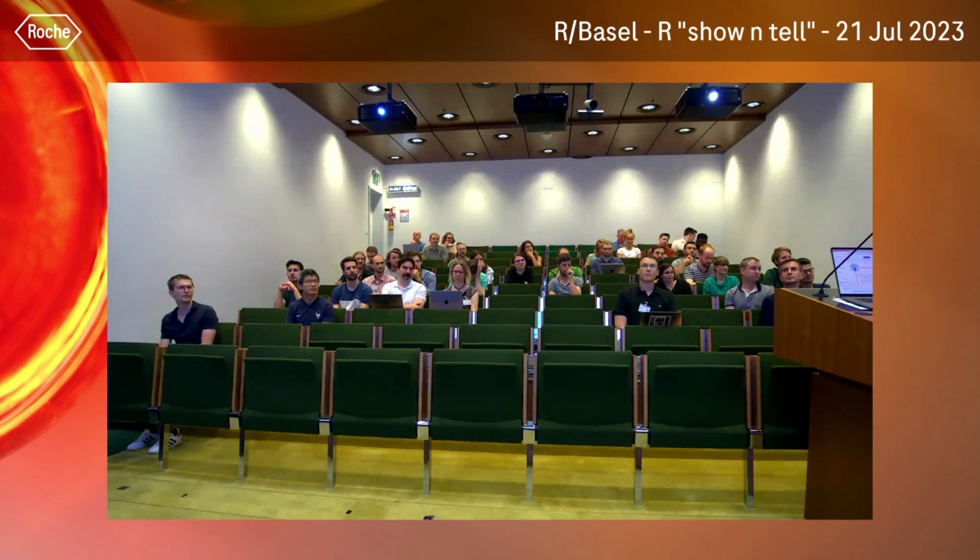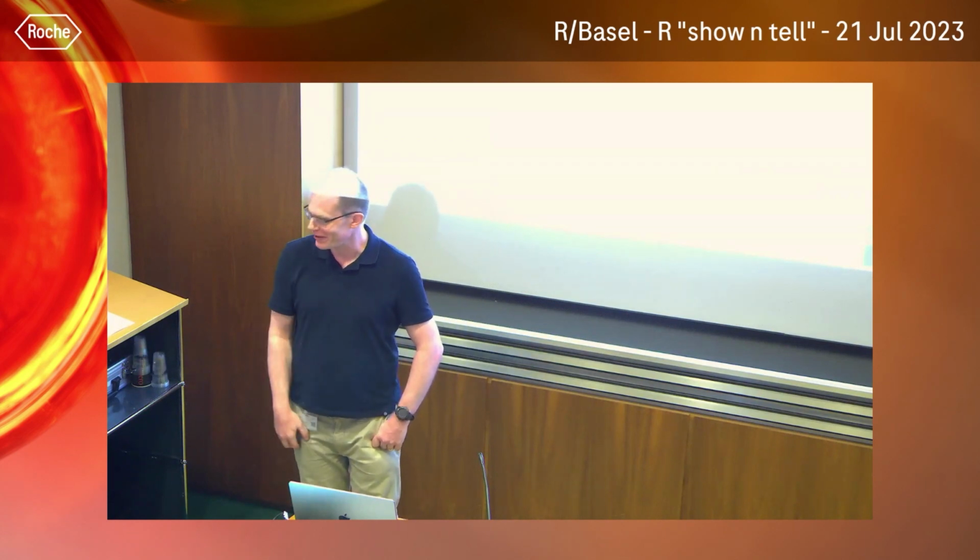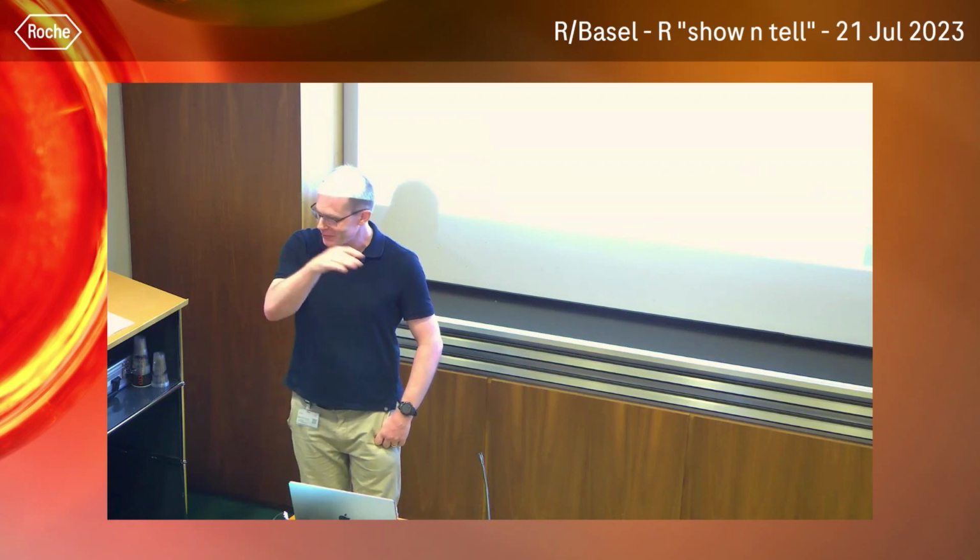From my side, I had the question: so you obviously tried a couple of tricks to get the buy-in of your customers. What is your feeling? First of all, it must be their data and not some abstract textbook. Yes, that's one message I got. And what other factors make it important? They really see the text of the command. They see normalize like this. That also helps them. And anything that is technical like ggplot will already distract them. So we try to encapsulate a little bit of the pain. I think once they start a little bit and they get the first plot, they suddenly think, okay, I can really do something.